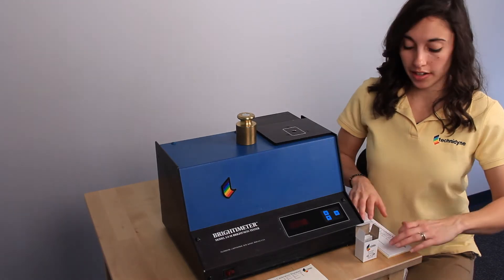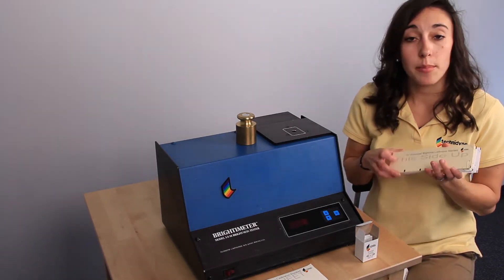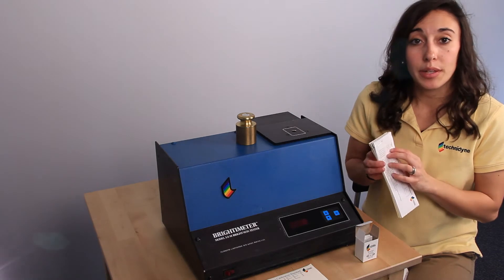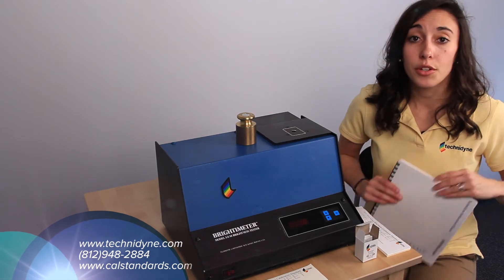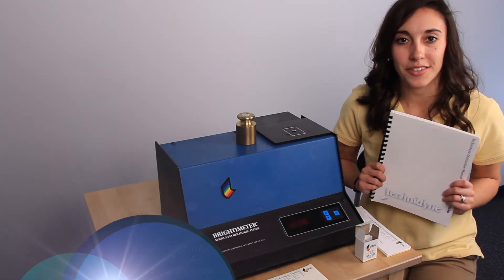To verify measurement linearity, you can take the remaining four sets of verification standards and measure each of the five positions across the standard. If you take the average of those five positions, it should be within plus or minus 0.3 of the average on the printout. If it's not, or if you have any other questions, you can refer to your Technidyne operator's manual, call Technidyne, or check out the website.